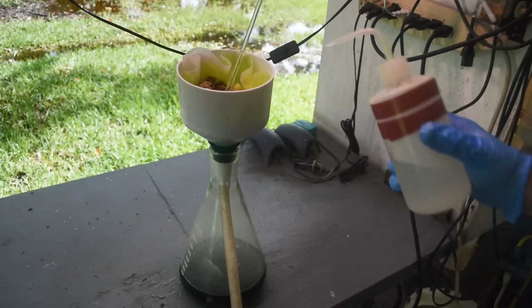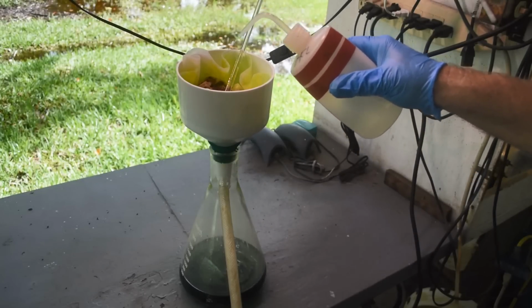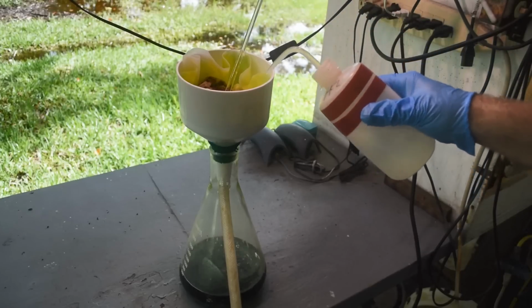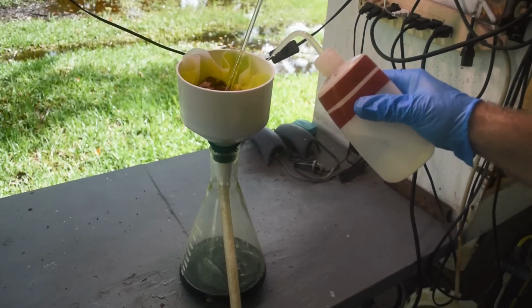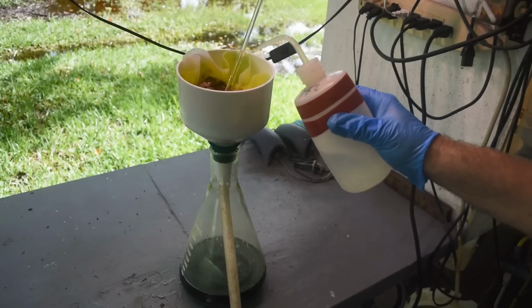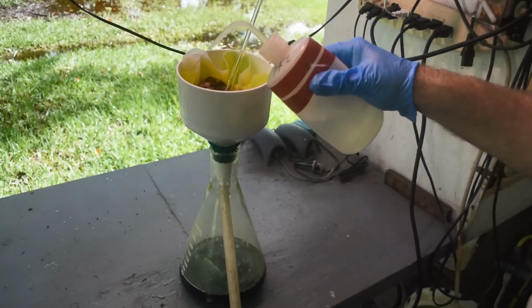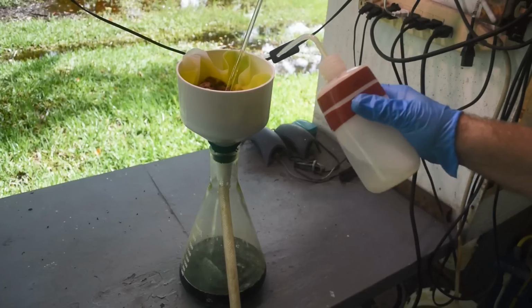So that was a bit of an ordeal. You didn't even see all of it. But I've got all of the red powder, the filters with the red powder in this funnel here, and I'm just going to wash it with some hydrochloric acid to try and get as much of the copper and nickel out of it as I can before we move on to trying to recover the palladium. Because it looks like it's got a lot of green stuff in it still. The stuff's coming through pretty green down here. So I'm just going to wash it with hydrochloric acid.